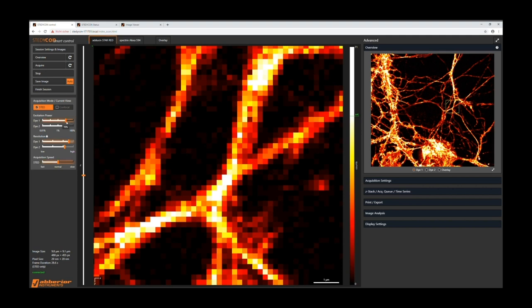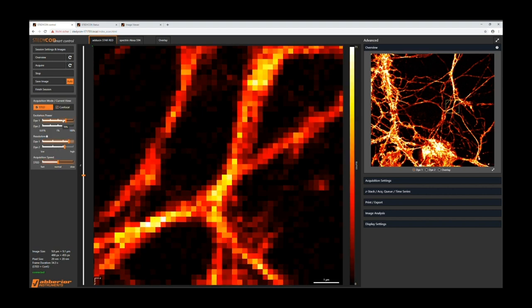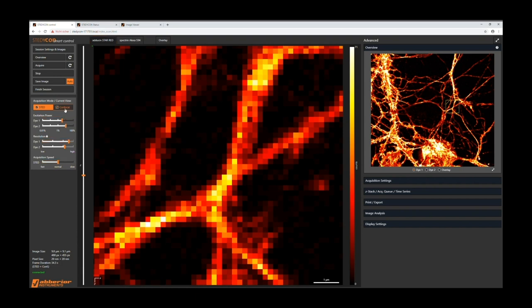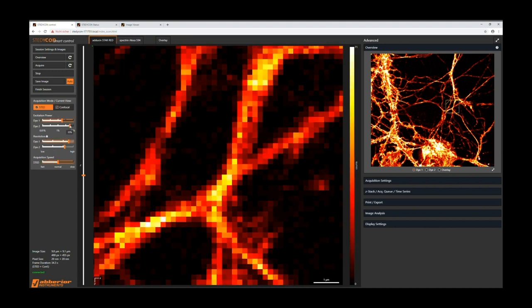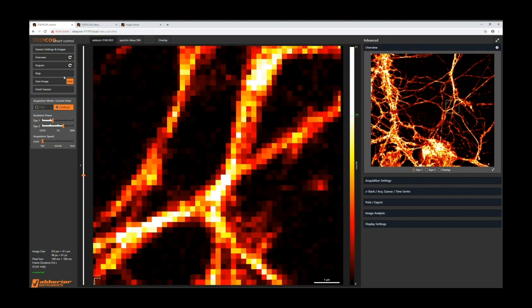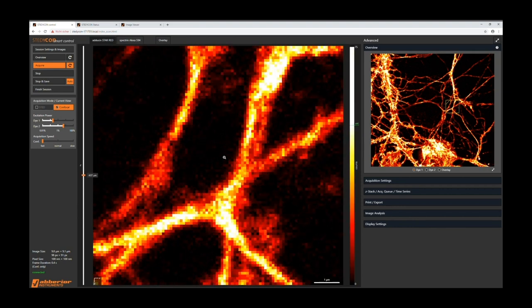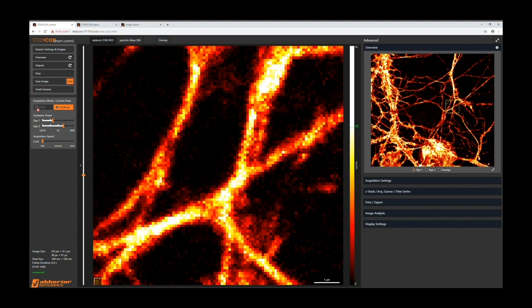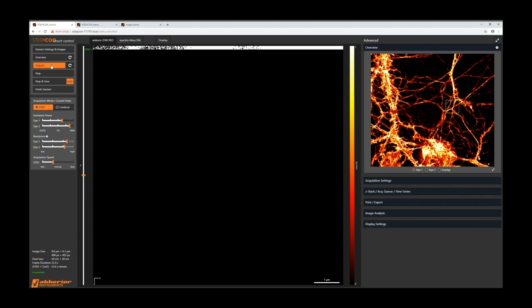That's how it looks in the overlay and the single channels. If you're happy with your focal plane, you draw a rectangle and it zooms in to that position. Now it's zoomed in. You have the freedom to choose your STED parameters: first the excitation power. I always recommend to first choose your confocal excitation laser power, then choose the STED laser power accordingly — which means increasing the excitation laser power for the STED, because STED images are usually much darker than confocal images since you get fluorescence from a much smaller point. Then you choose your resolution, which is a measure of the STED laser power. Finally the acquisition speed. You can quickly turn off STED again to see in confocal if you're in the right focal plane. Then click on STED and go on Acquire, and this will directly acquire your STED image.